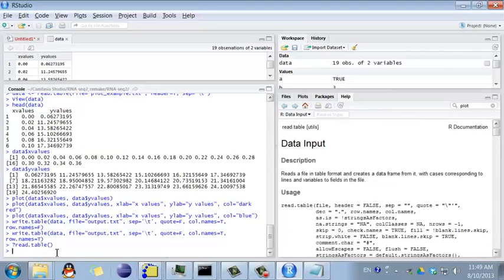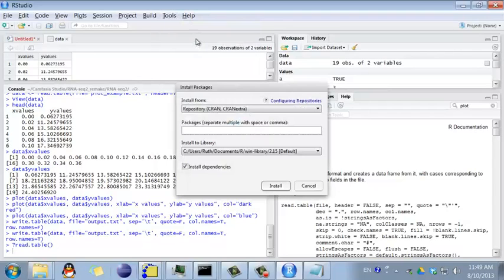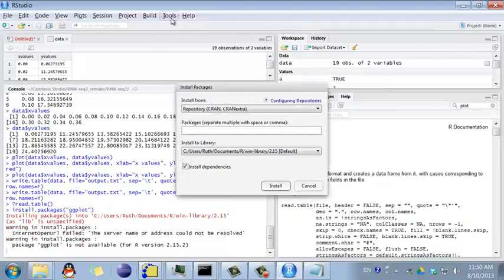The last thing I want to show you is how to install packages. RStudio offers a handy way to do it from the user interface. Now let's type in the name of the package. Usually it will generate a drop-down list, and we can select the package from the drop-down list and click install. It will automatically install the package. Yeah, so now it generates the drop-down list.